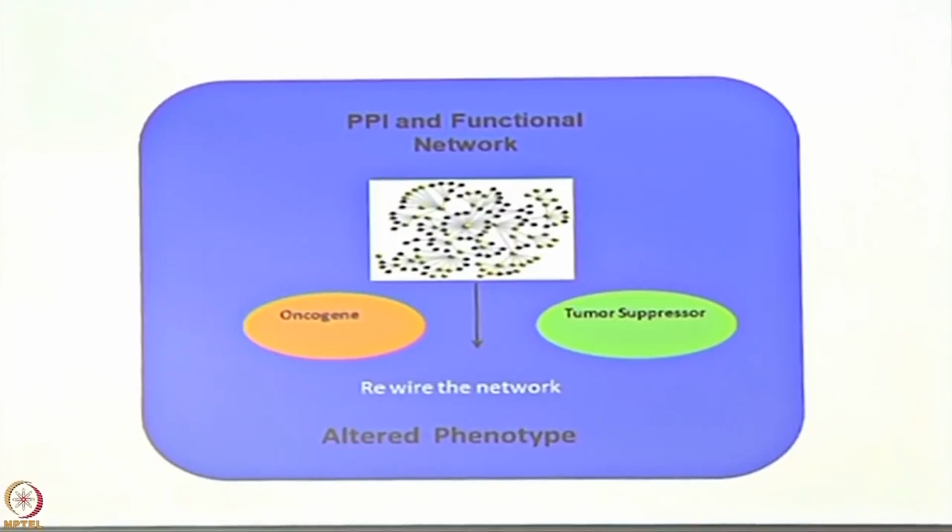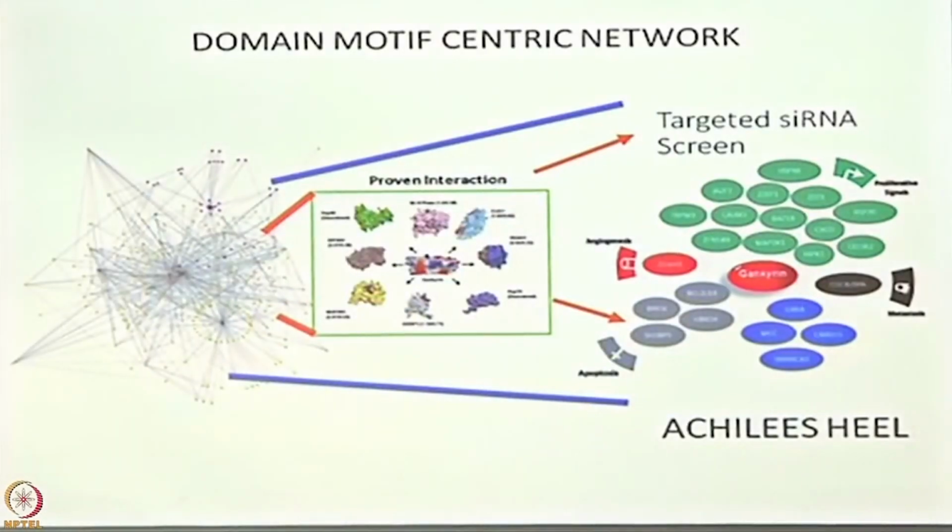Now, how do you view this in the concept of protein-protein interaction? How do you study it using biophysical techniques such as SPR? So as I said, this is the network. This is made of multiple interactions. So what you try to do is, can I find a subnetwork within this that I can describe in terms of known structural and biophysical principles?